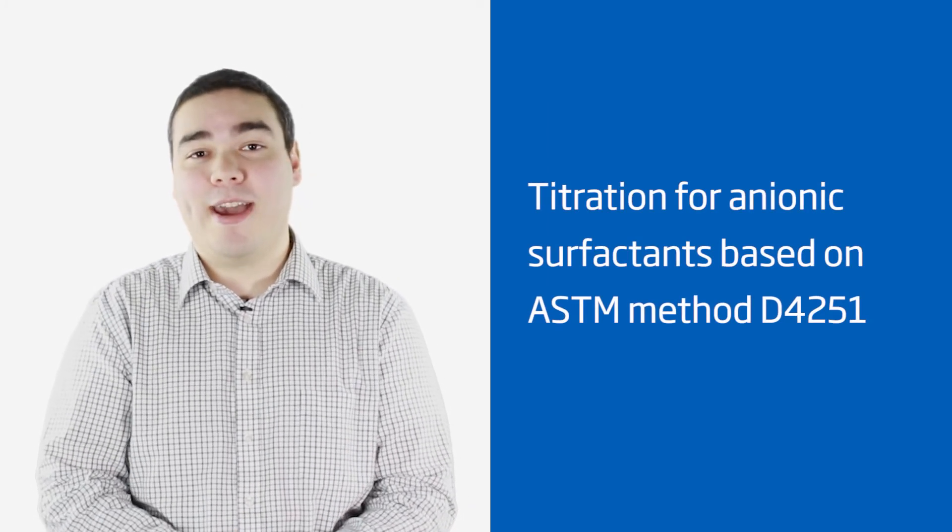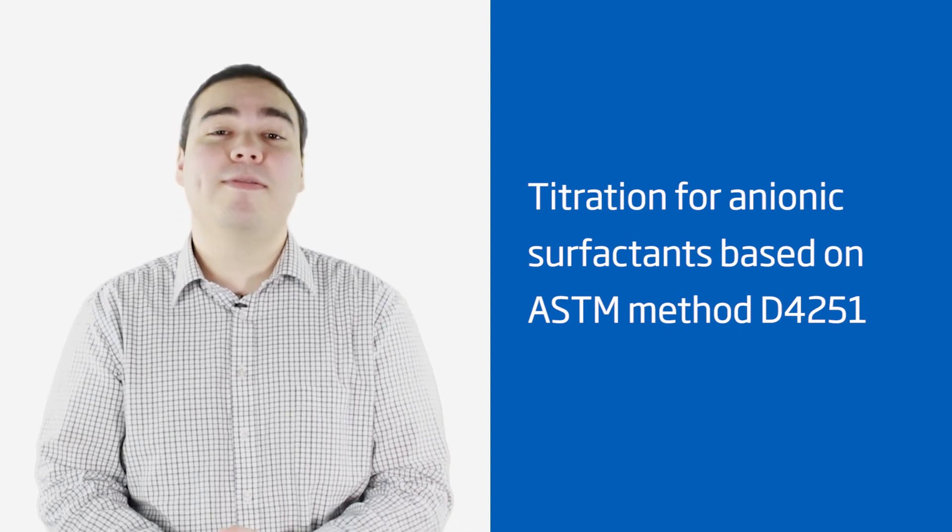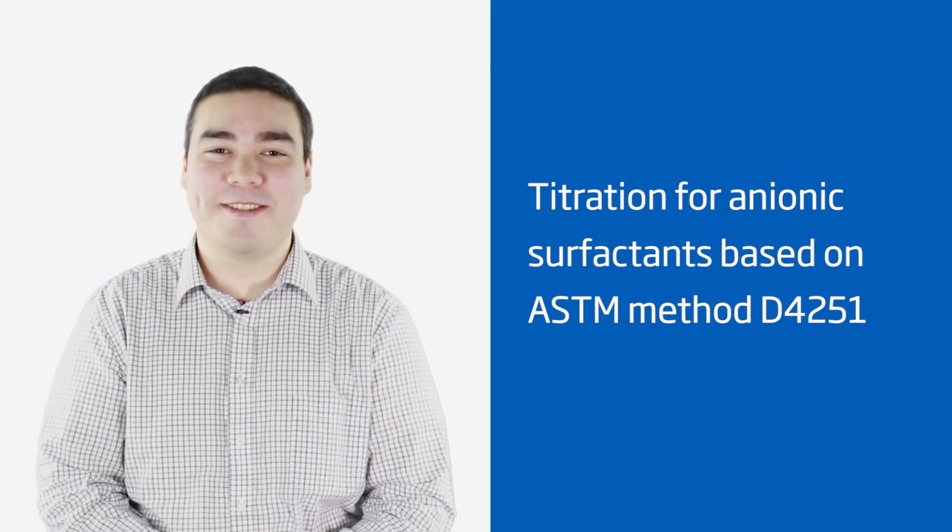Now, I'll show you how to run anionic surfactants. Anionic surfactants are found in soaps, detergents, and a wide range of other products. Our method for anionic surfactants is based on ASTM method D4251 and is very straightforward. So, let's get started.